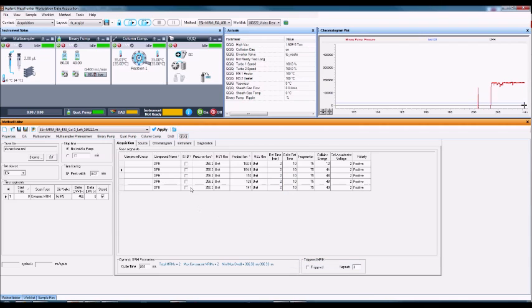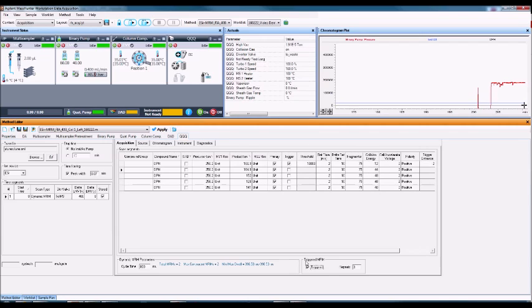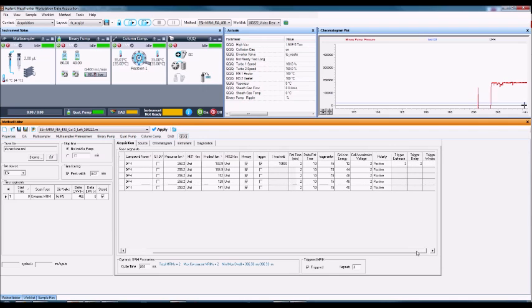I'm going to turn this into a triggered MRM method. When I do that, I not only get an expected retention time, but I also set the transitions that I want to use for my trigger. So I'm going to set my default trigger for the most abundant acquisition MRM to 10,000. And when I do that, I'll have another couple entries to put in.